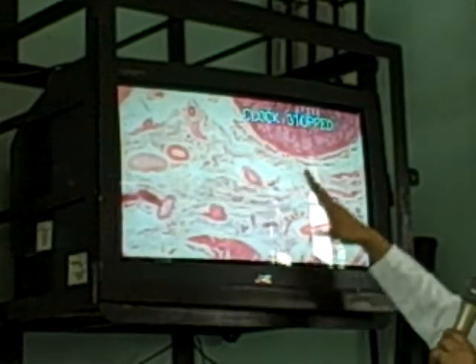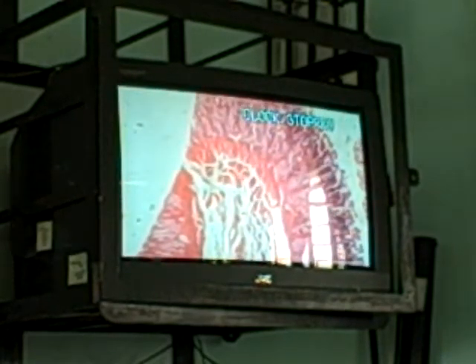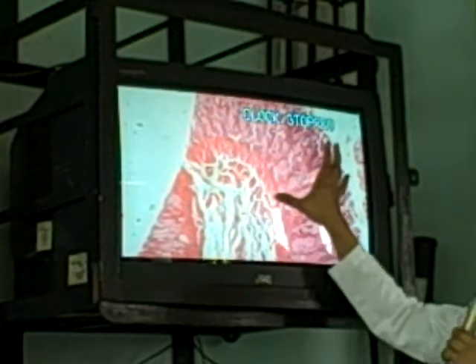Okay? And what is this portion, class? This one, from the mucosa down to the submucosa, that forms the fold. What fold is that? It's your plica circularis. Actually, the submucosa should be only up to this portion, but they extend forward to form a fold, and that is your plica circularis, wherein it is made up of submucosa and mucosa.